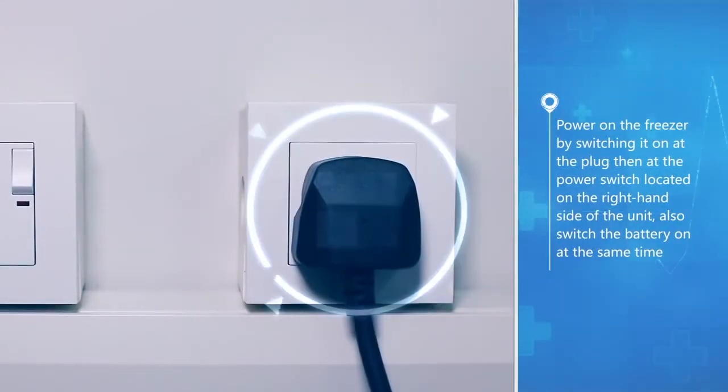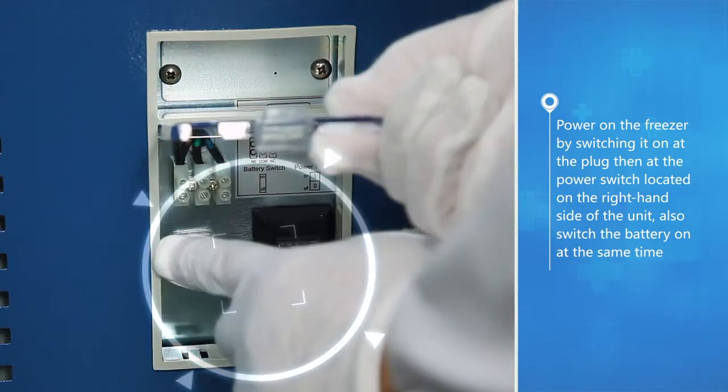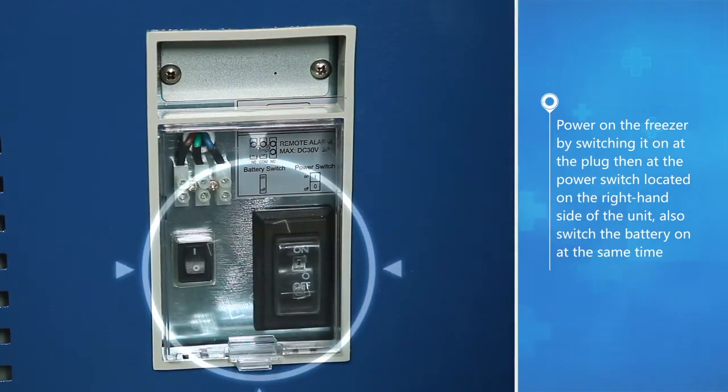Power on the freezer by switching it on at the plug then at the power switch located on the right-hand side of the unit. Also switch the battery on at the same time.